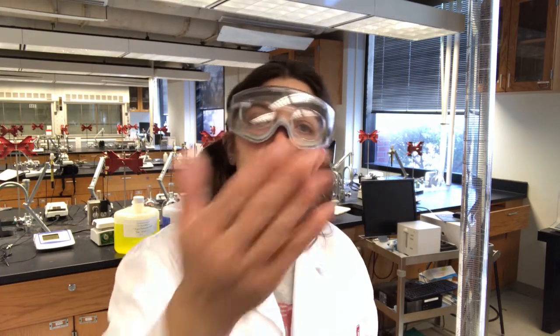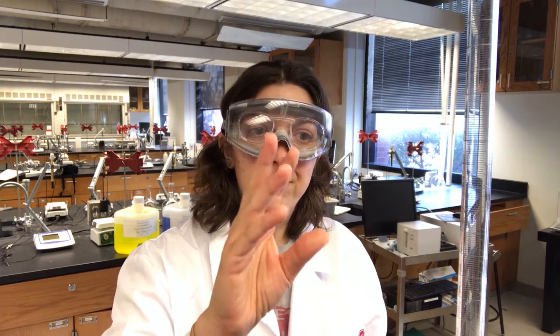We're going to be doing some titrations with sodium hydroxide, so you'd want to be rinsing with sodium hydroxide. You don't want to be rinsing with water. Maybe you rinse the first time with water, but after that, you want to be rinsing with the solution that you're putting into the Buret. That makes sure that you're not diluting the sodium hydroxide or whatever it may be in any way with water, if you were to only rinse with water.